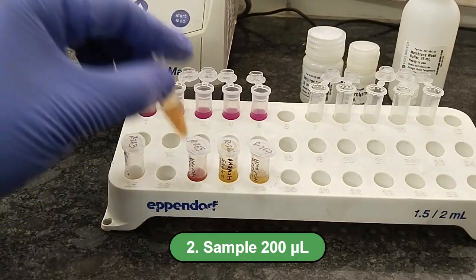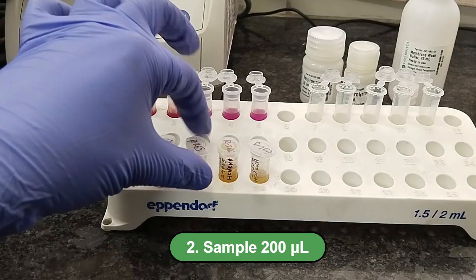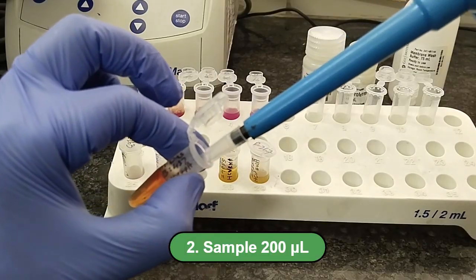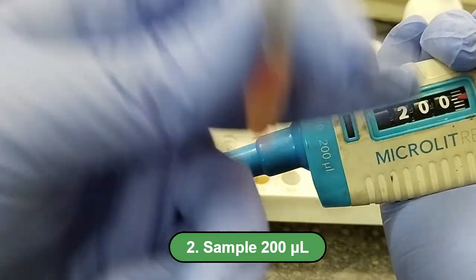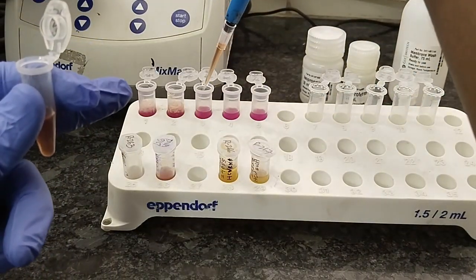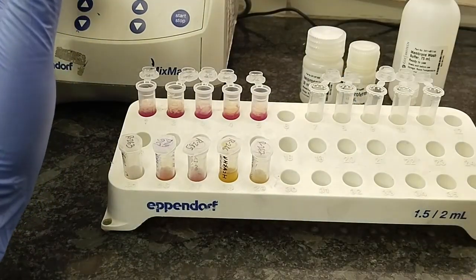Before adding the sample, we have to make sure we add the exact volume, exact 200 microliter. If you take less or more volume, it will affect the viral load. So before adding, we have to make sure that exactly 200 microliter is aspirated. Now sample addition is completed.